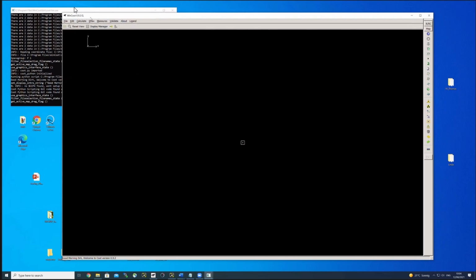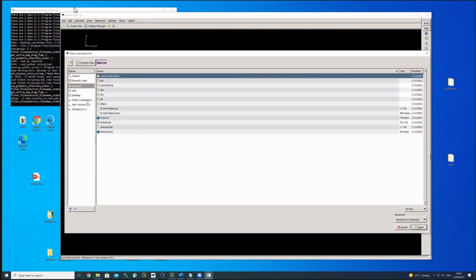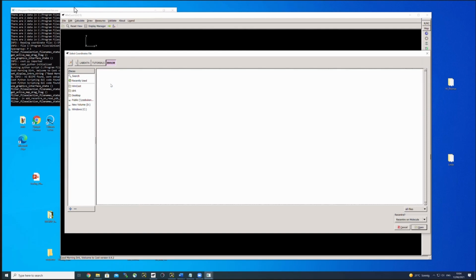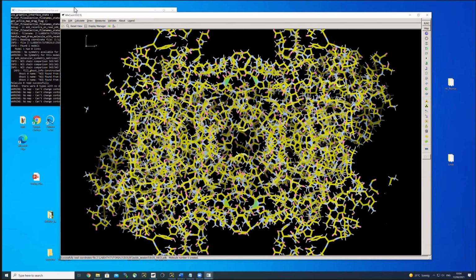Okay, so in Coot, once you have this up and running, you don't need the latest version for that. There's a basic function you will find in all of the Coots. There is a Coot also for Macs, for Linux systems, and for Windows, so there's something for everyone. You just go to Open Coordinates, and we go to the folder where I just saved this model under Tutorials, Isolde, Session 3, ABCD. Okay, here's the model. This is how it looks in Coot.